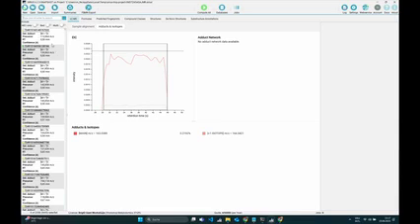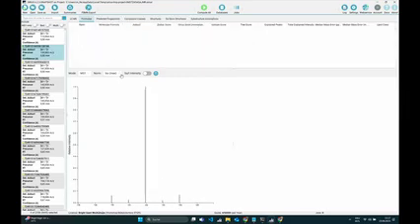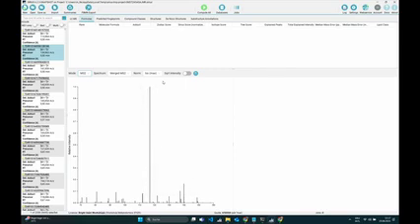Okay, now just to go through this in a little bit more detail, what you can see here at the top, again, the feature ID, then the detected adduct, if some adduct was detected, the precursor mass, the retention time, and then what Markus talked about, this confidence score, but because we haven't computed anything, we also don't have any confidence score yet. So let's get to the computation. Because if you just look through the tabs, everything here is quite empty. What you can look at before you do computations is the spectra, for example. But the interesting stuff comes really when you start computations.